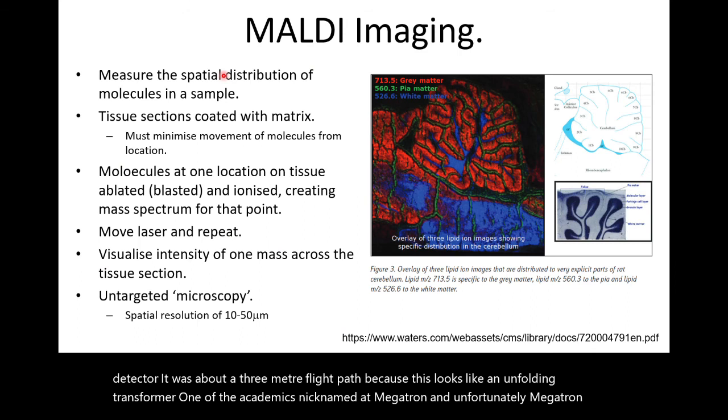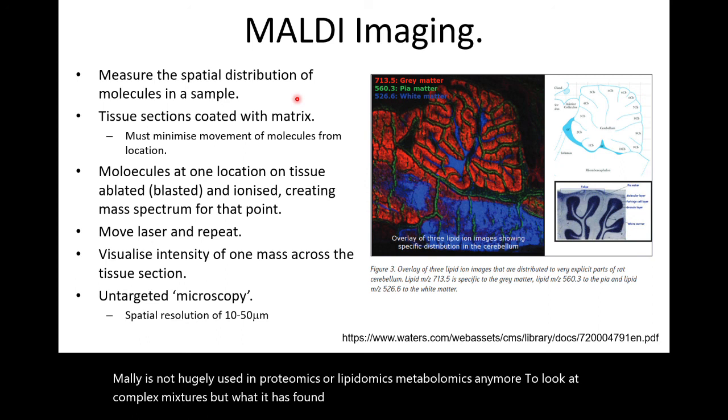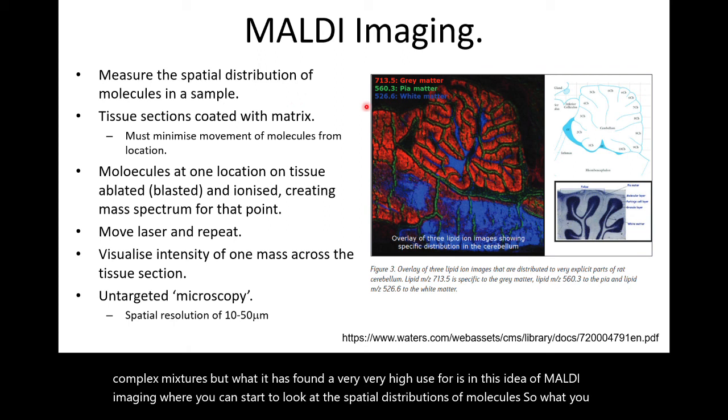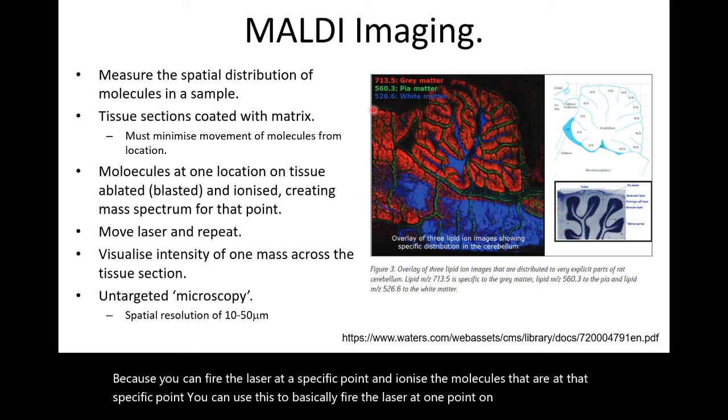MALDI is not hugely used in proteomics or lipidomics, metabolomics anymore to look at complex mixtures. But what it has found a very, very high use for is in this idea of MALDI imaging, where you can start to look at the spatial distributions of molecules. Because you can fire the laser at a specific point and ionize the molecules at that point, you can fire the laser at one point on a piece of tissue and get a mass spectrum of everything at that point. And then you move to the next point and you repeat the process.